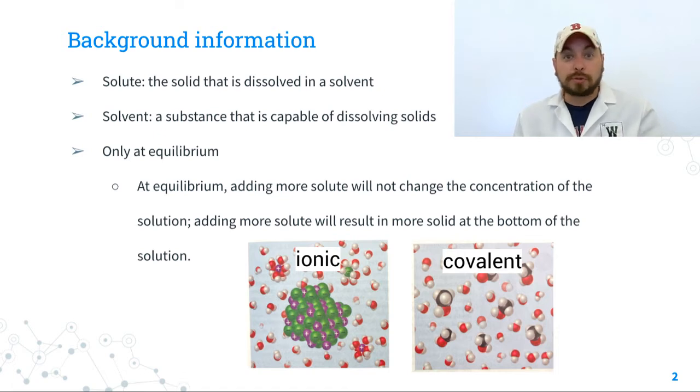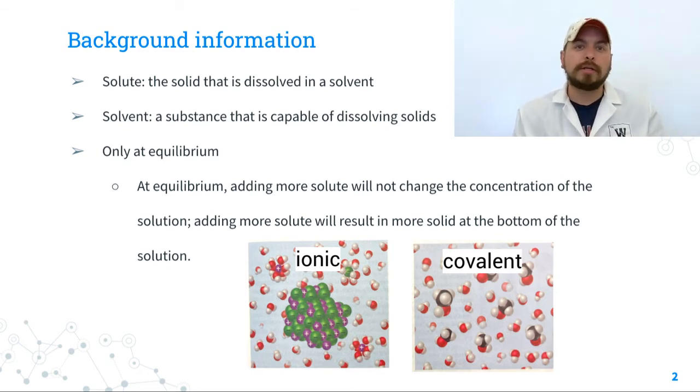And if it's saturated, that aqueous solution is at equilibrium, which means we can add no more solid without it staying solid. It won't dissolve anymore. So when we look at a saturated solution, one of the pieces of evidence that we're going to look for would be solid sitting at the bottom of that container. If we've given it enough time to dissolve, if we've stirred it sufficiently, and yet it's still not dissolving, we know that solution is saturated.